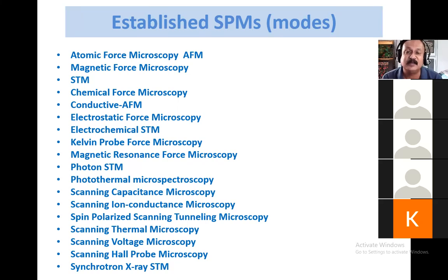understand, is that there are so many different types of probe microscopies, and these different kinds of probe microscopies are going to give you some information about your sample, some physical or chemical properties of your sample. Therefore this is not just a technique to visualize the sample surface, but it is also a technique to characterize the sample, and therefore it comes into the category of a spectroscopic method.